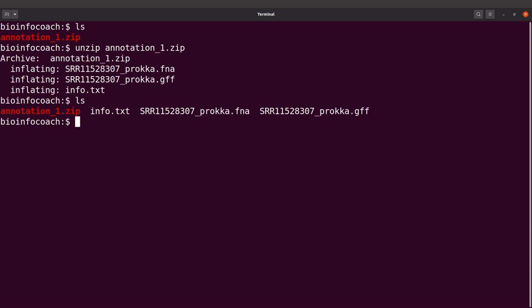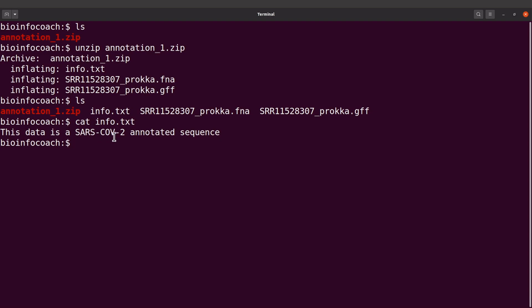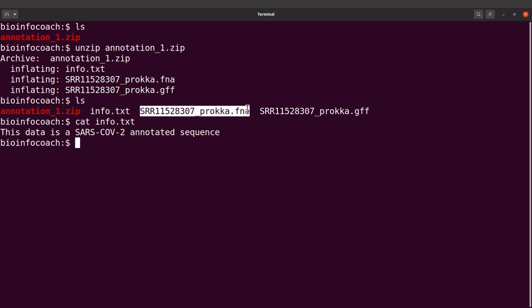That's done. If I do an ls I'll find the files. The info.txt gives a brief description: this data is a SARS-CoV-2 annotated sequence. I've already made a tutorial showing how to annotate a SARS-CoV-2 viral genome — check the description box for the link to that video, since we are using the output of that tutorial here.